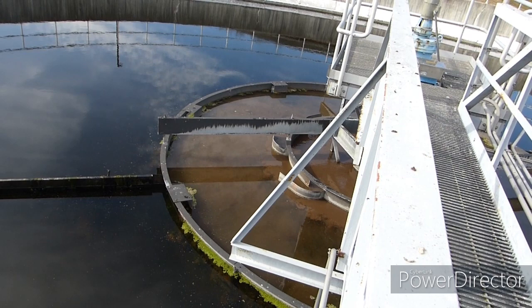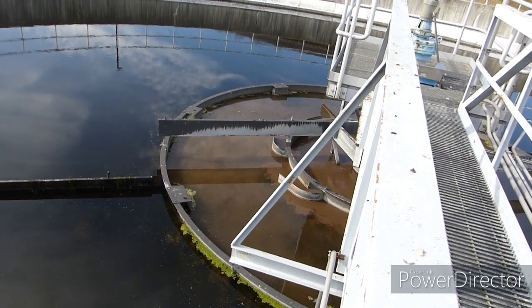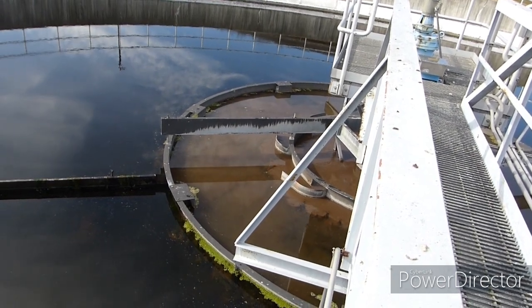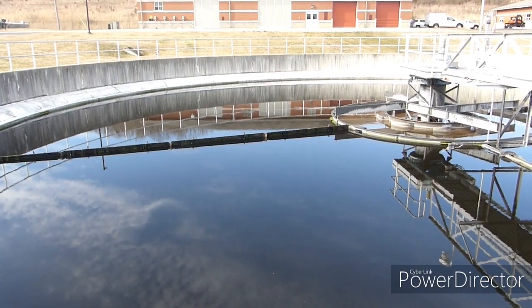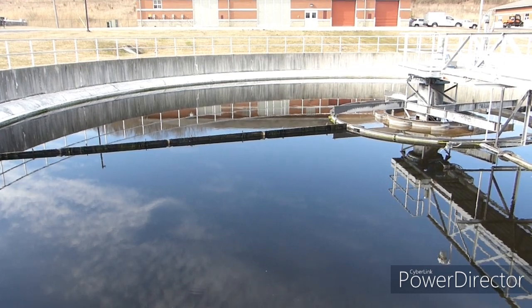As the mixed liquor enters the clarifier, it begins the settlement process. Settled sludge is returned or wasted off in this process. A simple sludge settlability test will help to understand how well this settling is occurring.